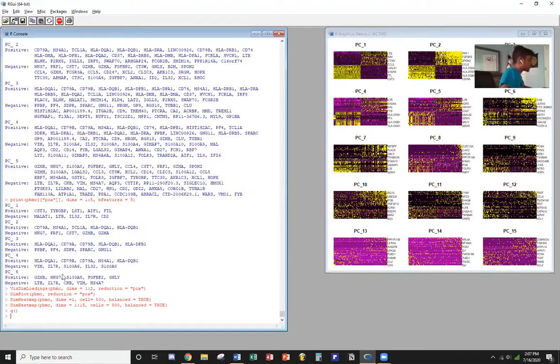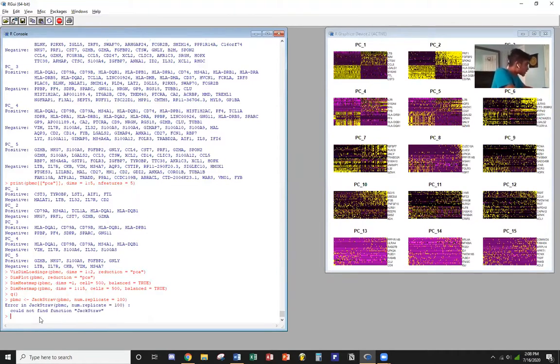Okay, so let's get to the coding part. PBMC JackStraw, so that would be the function. PBMC, the original data set we are using, plus dims 10, num.replicate. Okay, I forgot the equal sign, that's okay. Error, oh, I put a V on accident, that's okay.